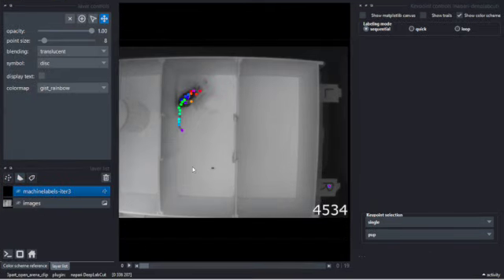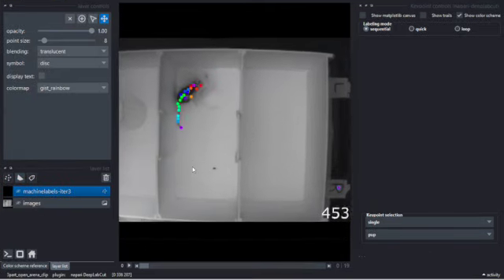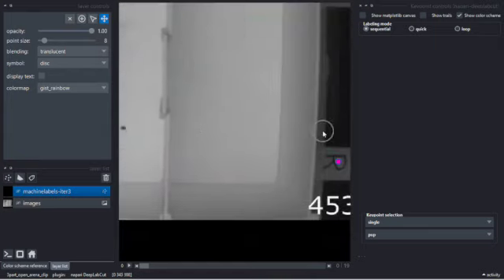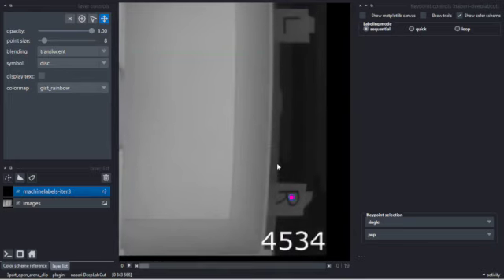So you can zoom in and out of the image, and you'll have to figure out how to do that on Windows. I'm doing it on a Mac, so I cannot tell you that right now. And then you're going to go to the select arrow, and then you can go to the X to delete the key points.